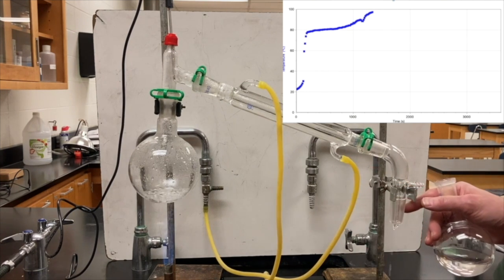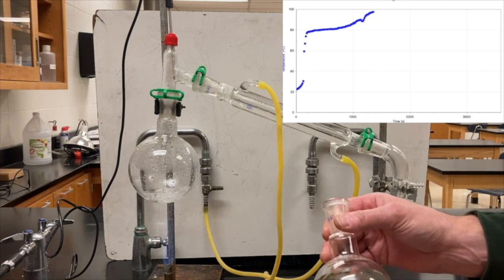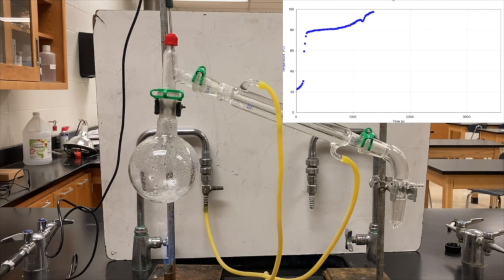I'm just setting that in place, and you can't see it, but I'm putting a beaker underneath the output from the condenser. So this flask should now contain, I think, ethanol, or fairly close to pure ethanol. Temperature continues to rise as it continues to boil here, and again we're starting to see it gradually achieve another flat spot on the graph. Again, you can't see it, it's off the screen, but there's a beaker catching what's dripping out of the condenser right now.